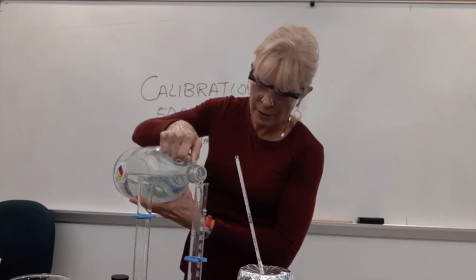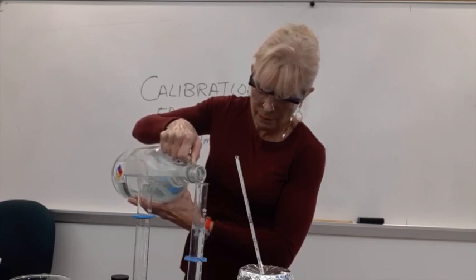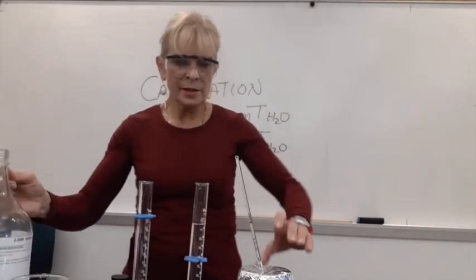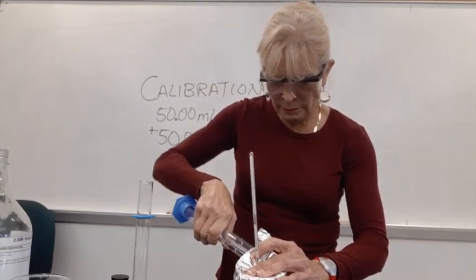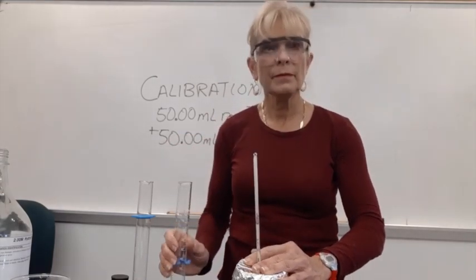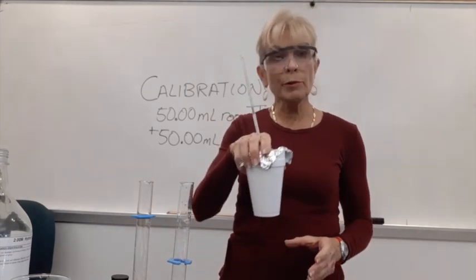measure out the required volume of liquid and pour this into the calorimeter. Swirl a bit, let it equilibrate.